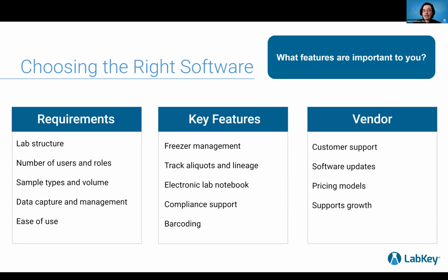So when you want to choose the right system, there are a few things to keep in mind. We want to know what different requirements you have for Sample Manager. That's knowing what your lab structure is. We want to make sure that we can support the number of users that you have. If you have any different organizational needs, like the volume of samples you're collecting, the types of samples. We also want to know how you are planning on capturing your data and importing it into the system. Do you want to do it through the software by importing spreadsheets like Excel, or do you want to do it through an API, which is communicating our software to other systems?